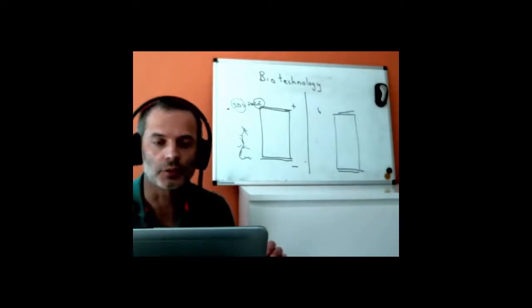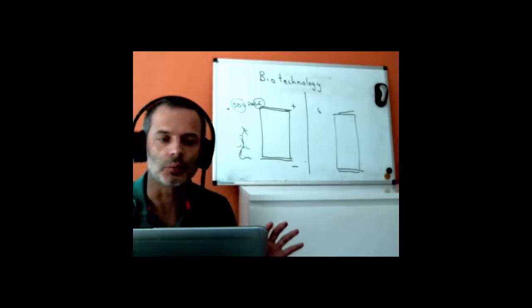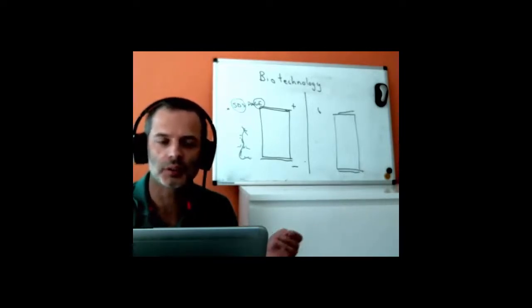So that obviously gives us a problem. We can't do the same type of gel electrophoresis as we did with the DNA because we don't know what the charge on our protein is, we don't know what the charge per unit length is, we don't really know very much about our protein. So we have to do something.